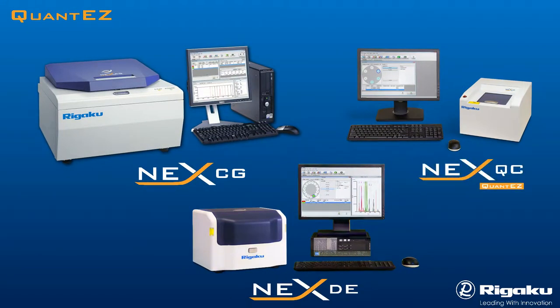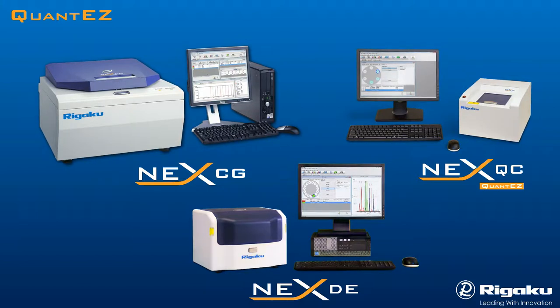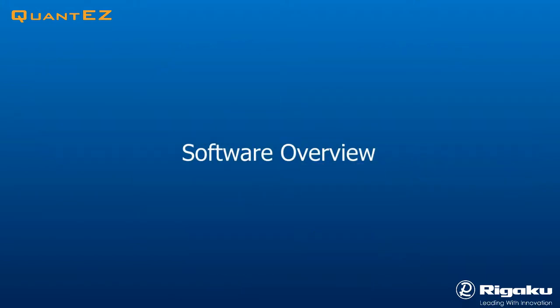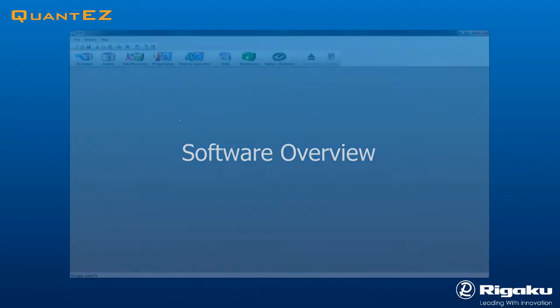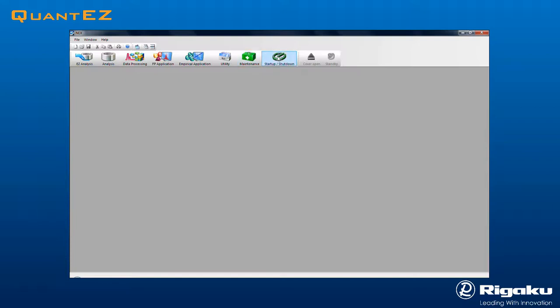QuantEZ software was engineered to be easy to use for routine analyses and easy to understand when setting up new applications and protocols. The top menu ribbon contains icons for all the major instrument functions. This design ensures that you will never get lost and can immediately go to whatever function is required.